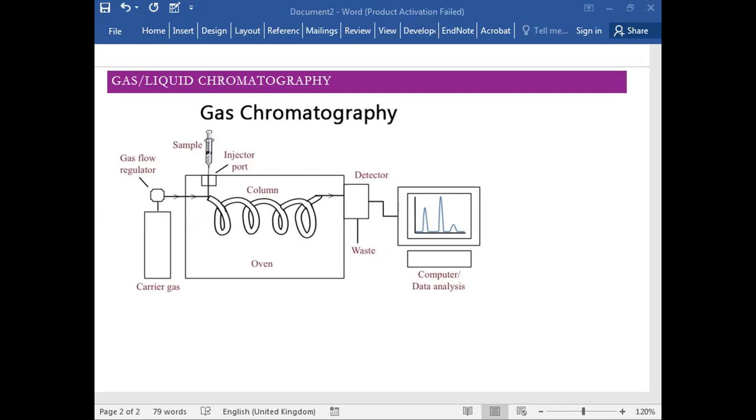इसको जरा clear करो थोड़ा सा. If I have a high boiling point component, if it is non-polar, for example bromine लेता हूँ and chlorine लेता हूँ, दोनों non-polar हैं. Bromine has a high boiling point, so bromine will take longer to reach the detector. Again, these are very vague examples, but just helping you understand. Obviously जिस चीज में van der Waals dispersion ज़्यादा, जिसका size of molecule बड़ा है, जिसका boiling point ज़्यादा, even that component will also take longer to reach the detector. Is this clear? समझ में?